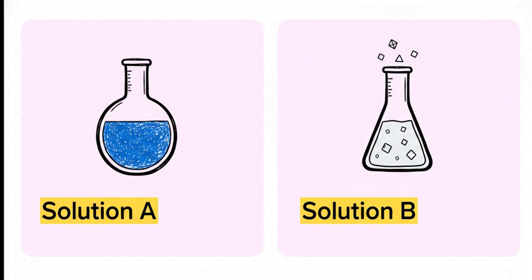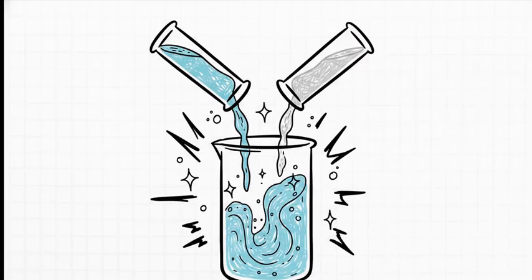So here's the absolute crucial point. You cannot just go buy a single bottle of premix Fehling's reagent and let it sit on a shelf. No way. It has to be freshly prepared. You literally have to mix absolutely equal volumes of solution A and solution B right before you plan to use it. If you don't make it fresh, that tartrate we mentioned eventually loses its protective grip, the copper degrades, and your test, well, it simply won't work.